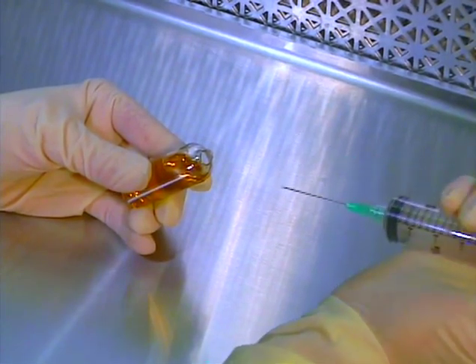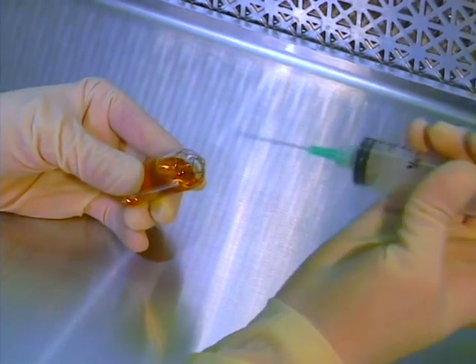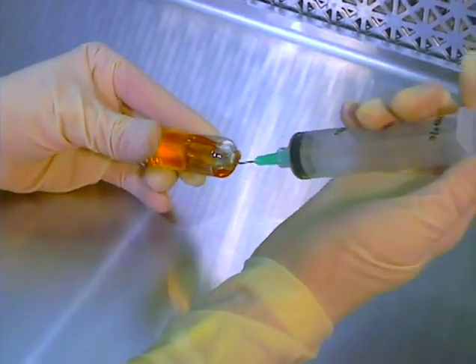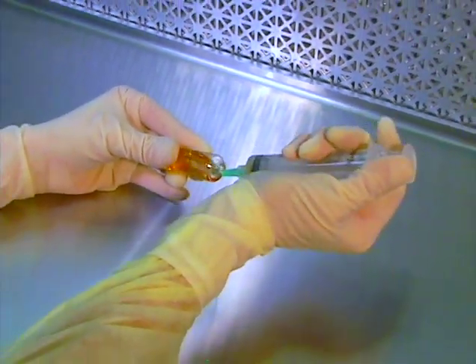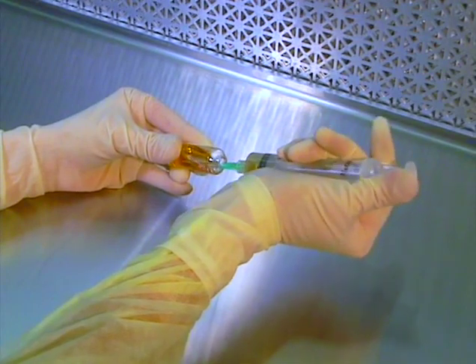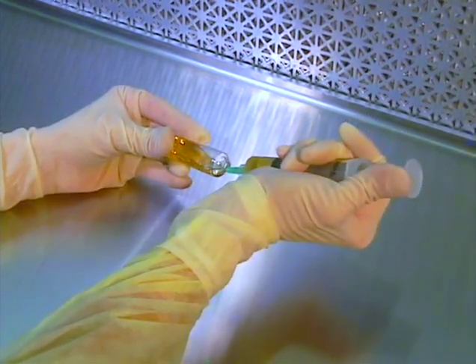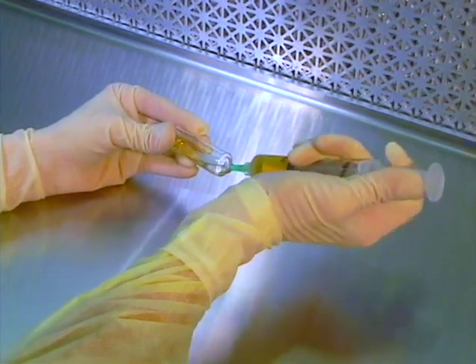Position the syringe in the other hand so that the palm is upward and the needle extends outward from the side of the hand, away from the thumb. Place the thumb under the edge of the plunger button. Tip the ampule slightly and insert the needle carefully into the neck, bevel side down. Push back on the plunger slowly with the thumb as you tilt the ampule farther to keep the needle under the fluid level, until all contents are withdrawn.